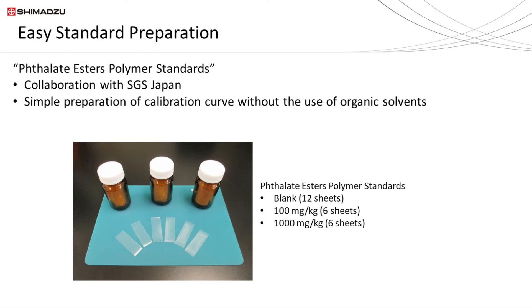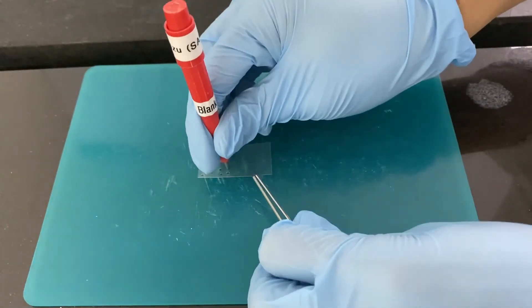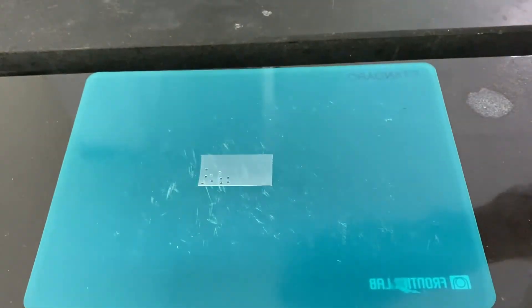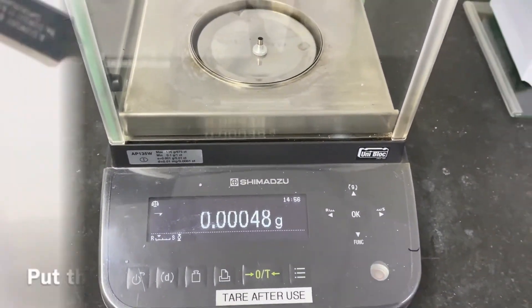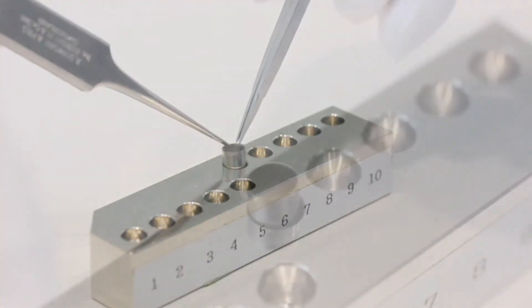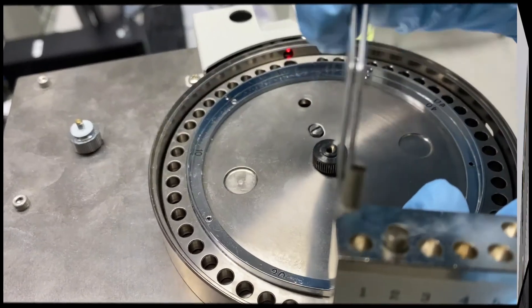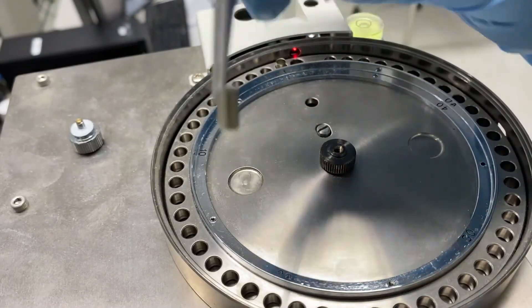The Shimadzu phthalate ester standard is designed for simple preparation to reduce preparation time. No organic solvent is required for phthalate ester standard preparation. It comes in three different concentrations for quality control checks and to build a calibration curve. The standards come in ribbon shape with fixed thickness. A special puncher tool called a micro puncher with a fixed diameter is used to punch out a hole on the standard. You only need to punch it two times to meet the weight requirement. Then record the weight, cover the sample with wool, load the sample cup onto the system, and start the sample analysis.